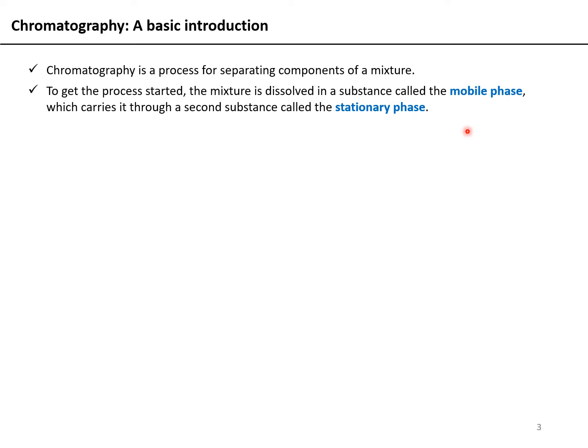which would essentially be your beads. So chromatography was initially discovered when it was observed that when you dip a filter paper into a solution containing a mixture of different colors, you can see these colors separating out as the solution absorbs up the filter paper. And that is where chromatography has its origin from. Chroma means color.